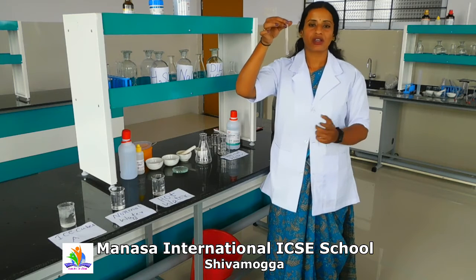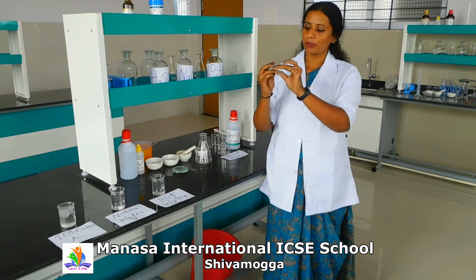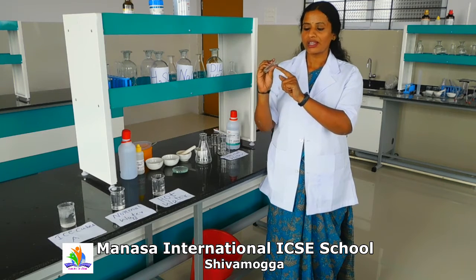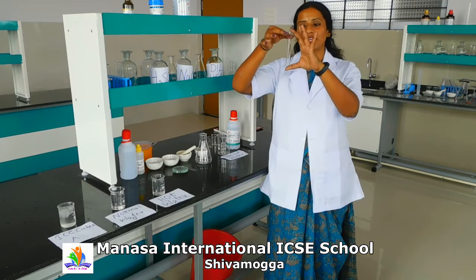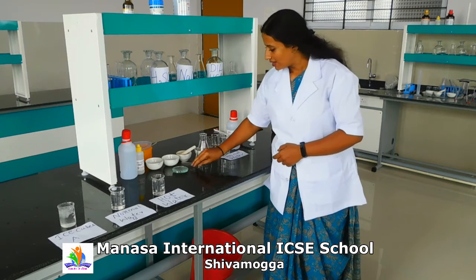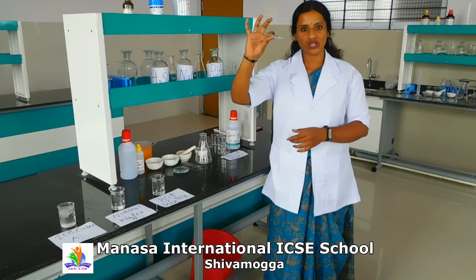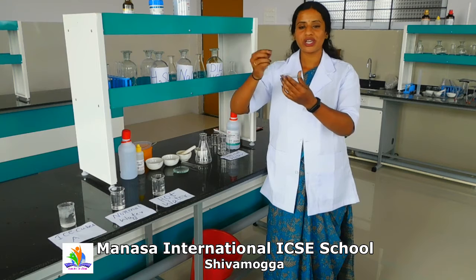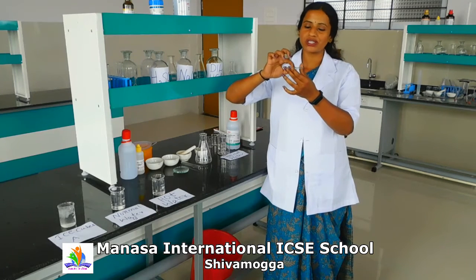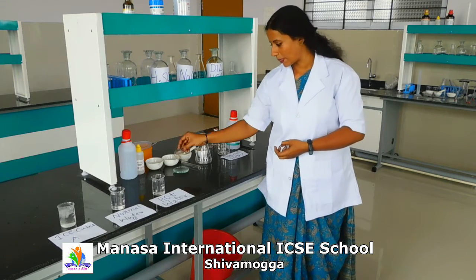This is also used for conducting different types of experiments, and it is also borosilicate. The measurement is 15 into 125, that is 13 ml. Approximately 13 ml of liquid we can fill in this. The next apparatus is the watch glass. This is called the watch glass. We take salts or crystalline salts on this so that we can weigh them and take them to the experiment.